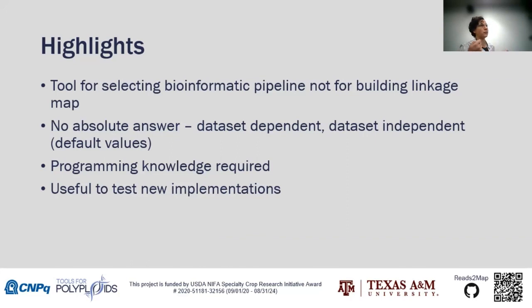I don't have a specific answer. I wanted to have a recommendation, use just this parameter, use just this software, but it changes. The workflow is very stable because I'm controlling all the versions, and just changing the data set gives me different results. So I don't have a single suggestion for all the data sets. But I do have some things where, okay, maybe this one you don't need to test.